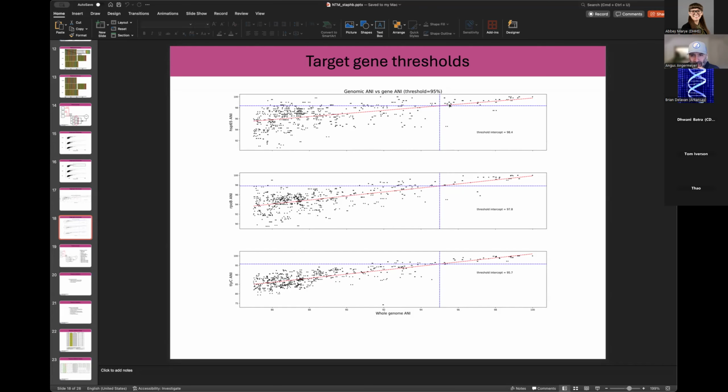Yeah. And so, like I said, I'd drop this blue horizontal line down to capture these two small ones down here. So we're getting everything. So yes, there is some confusion, and there are areas where there would be problems like that. But all that would be to reduce false negatives. I have to drop that down.